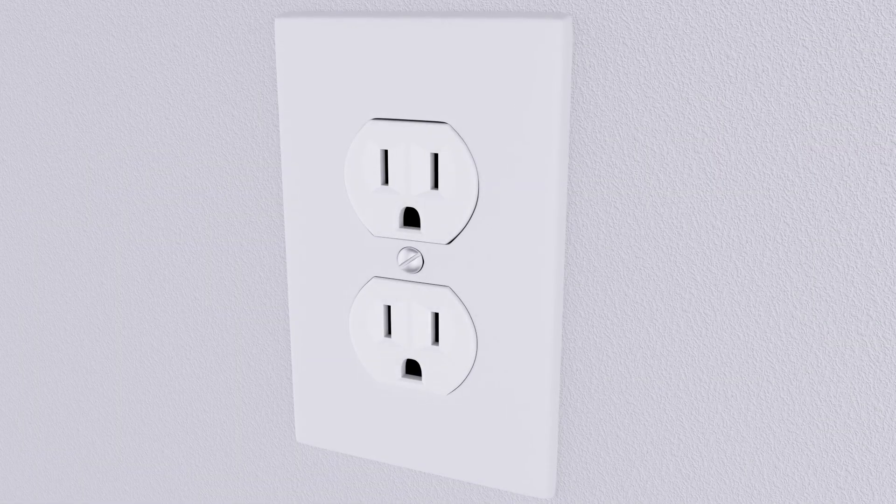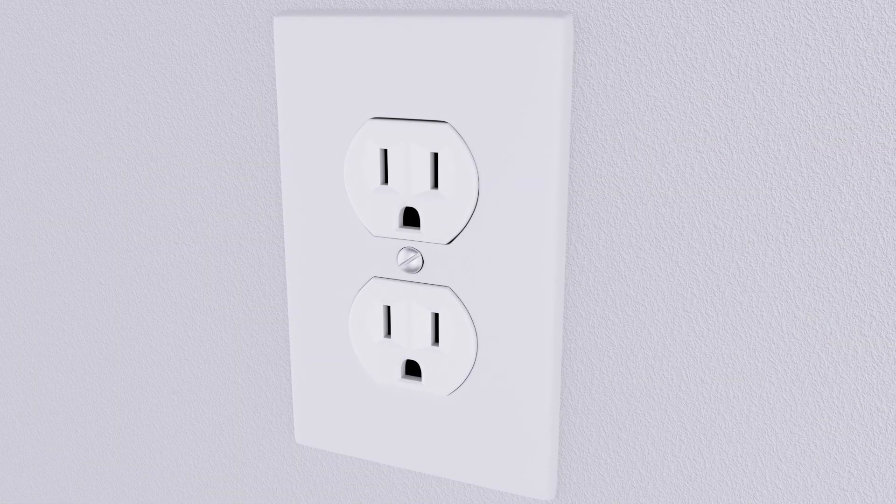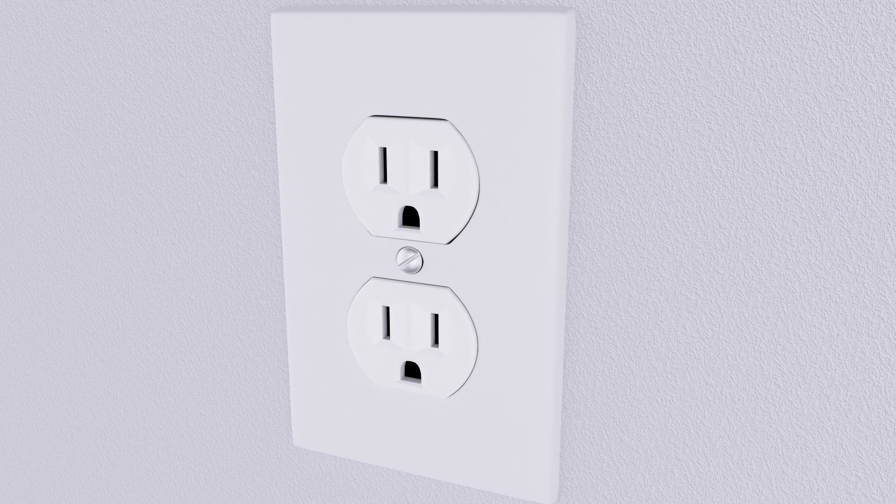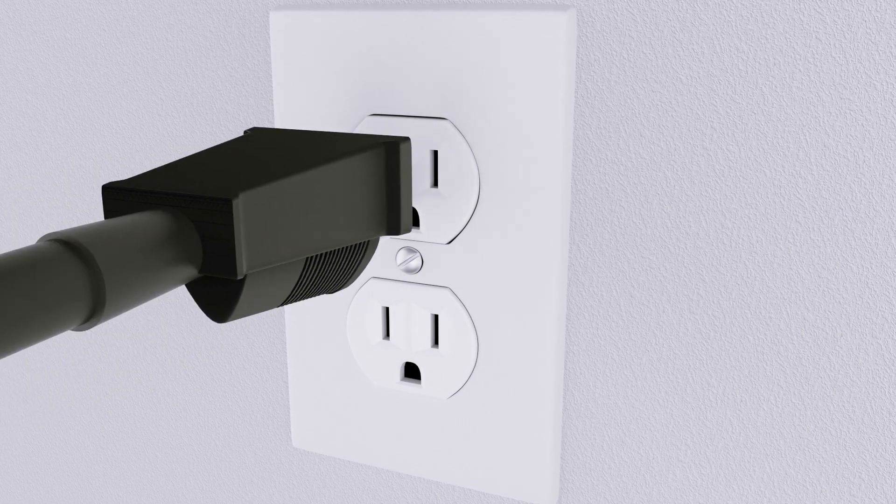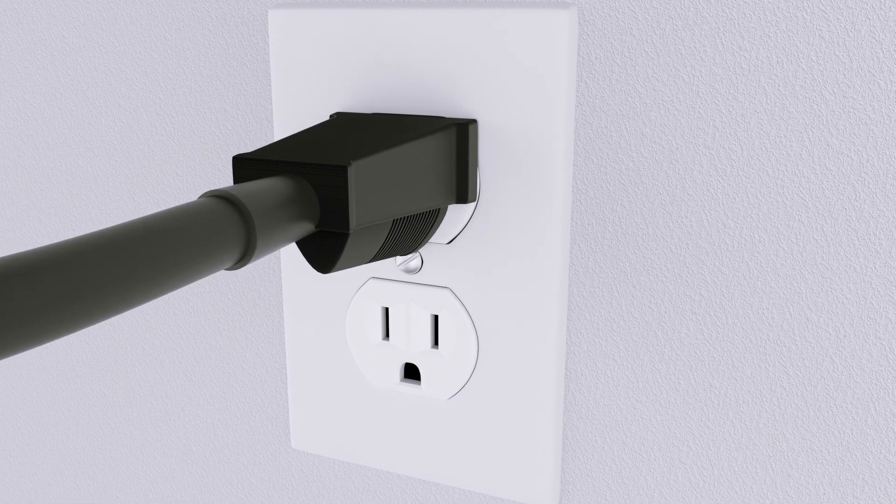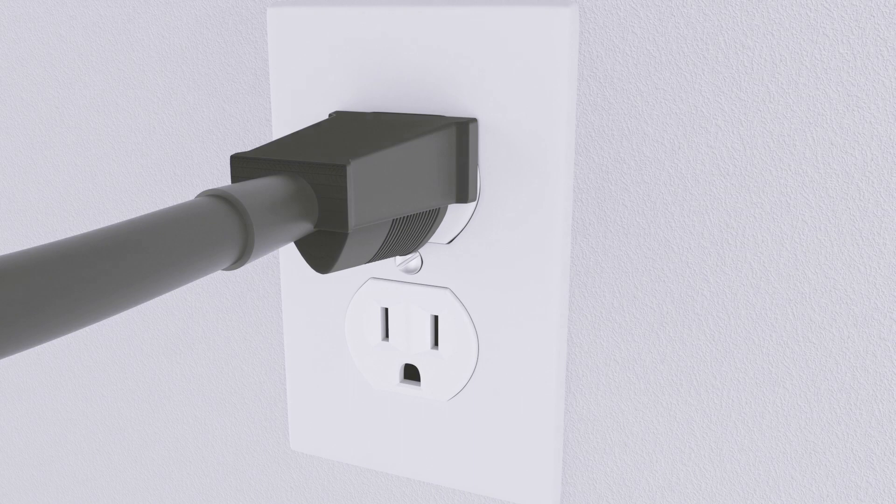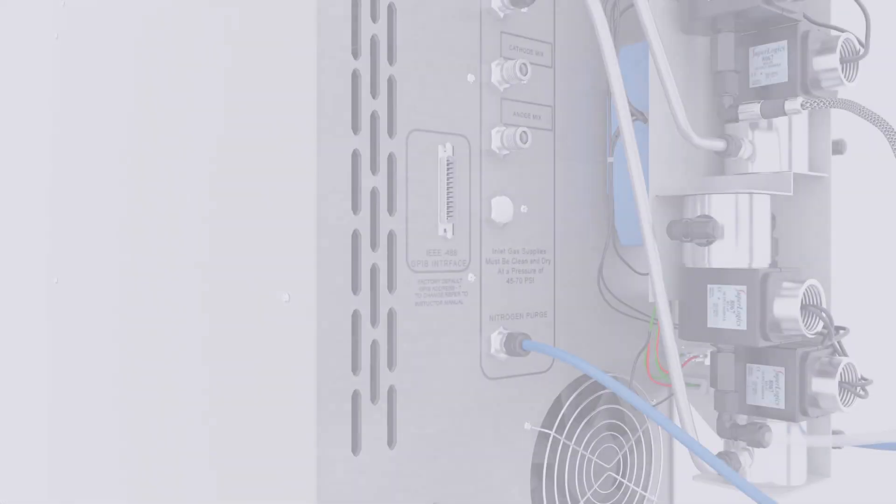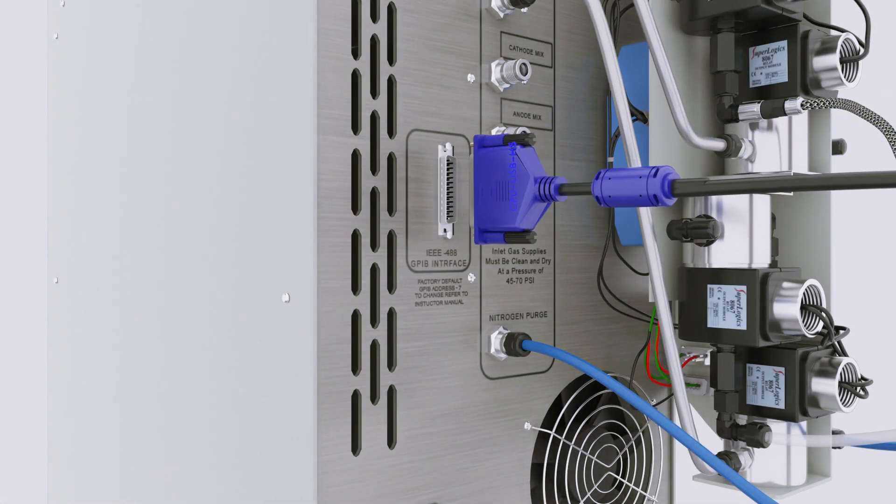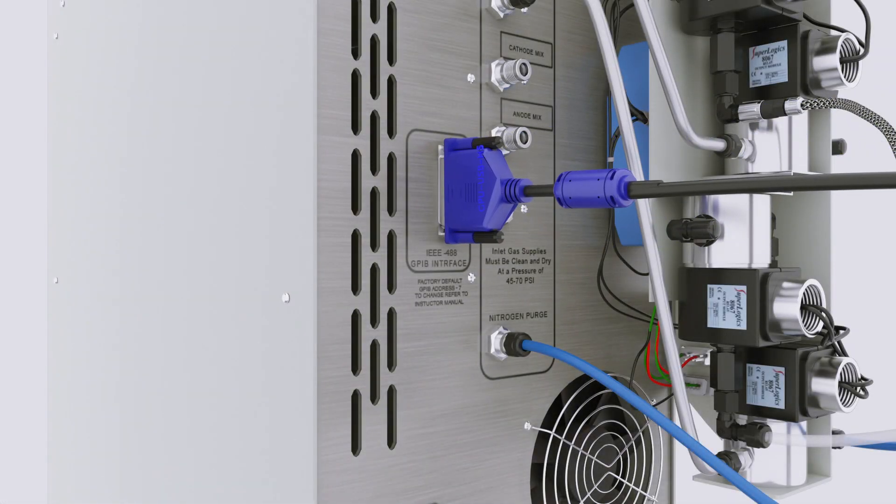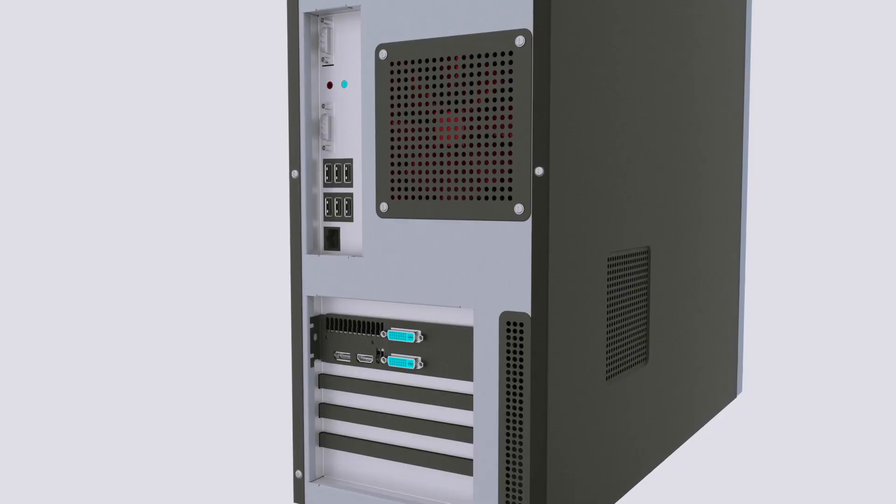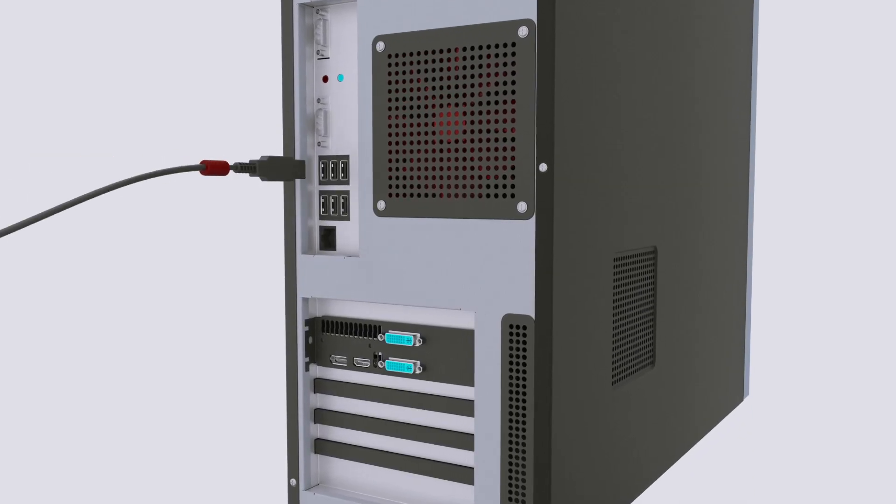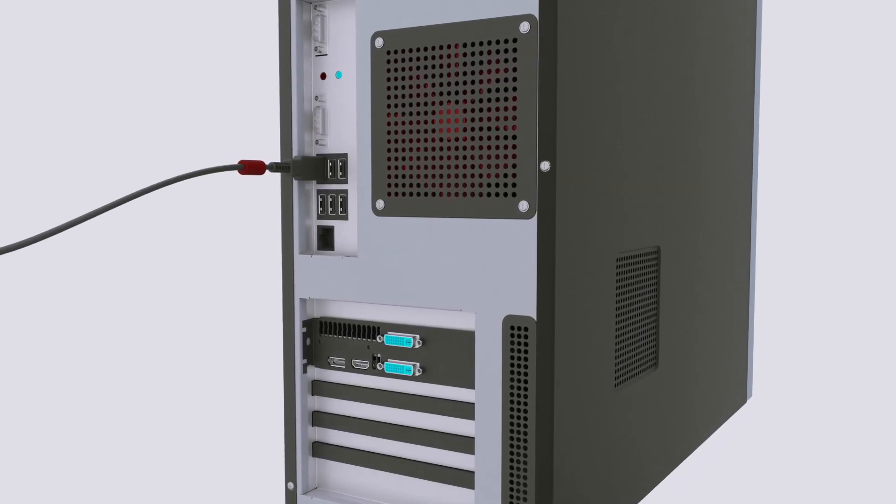Connect the 850 to a standard power outlet. 120 VAC or 230 VAC configurations are available. Connect the GPIB to USB adapter to the GPIB connector. Connect the other end to a USB port on a Windows PC.